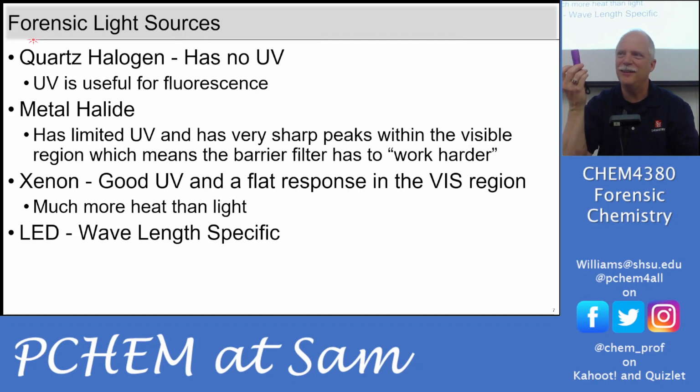You know what they use these for? Anybody? The pet urine. Okay, bodily fluids. So that's what we're talking about, alternate light sources. You can buy these on Amazon, and you look around your house, and you've got a funny smell in the living room. You find it on the curtains. Your cat has sprayed the curtains. Okay, so now you know where to spray the Febreze. And that's actually a good product, because it doesn't just cover the smell. It has a mild oxidant in it. I don't know what the oxidant is.